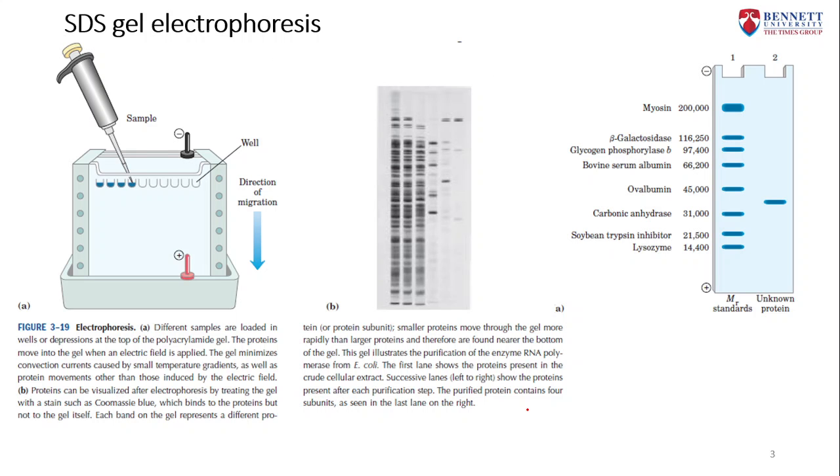So the SDS-PAGE electrophoresis principle we already know from last semester, so I'm not going into detail on that. How it experimentally works: you load proteins on a well, which are linearized using SDS, so that they have a cumulatively negative charge on the backbone due to SDS binding to it, and then they are also rid of any linkages like disulfide linkages by addition of reducing agents.